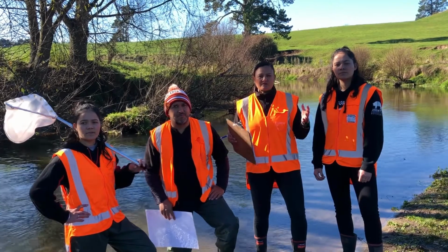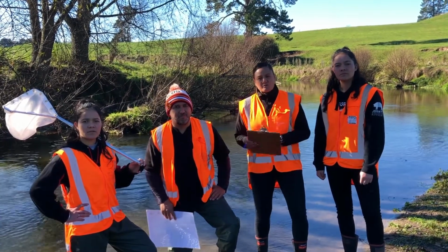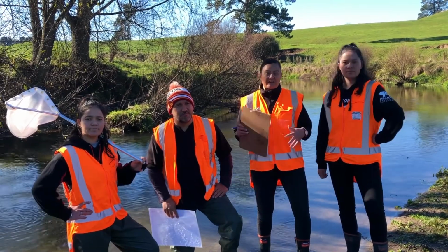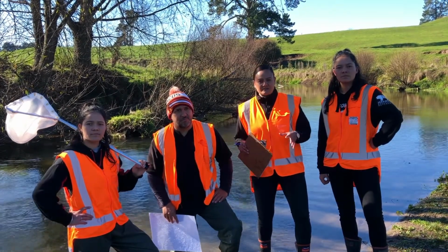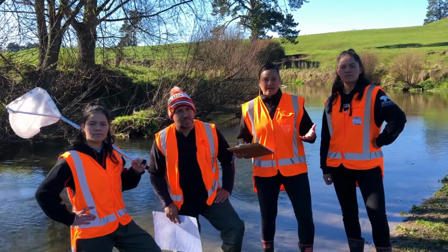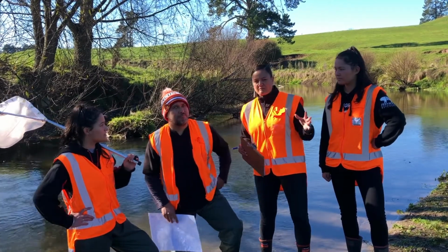Come on. So we've used a SHMAK kit today to take a whole heap of measurements, and really at the end of the day what those measurements tell us is how healthy is the stream. So from all the measurements we've taken, what we can say is it's probably in a fair condition of health. So it's okay, but it's not the best. So there are certain things that we can do to really get the condition of the stream back up to really healthy. So what are some of the things that we can do, Anaru, to get the stream back to a really good condition?